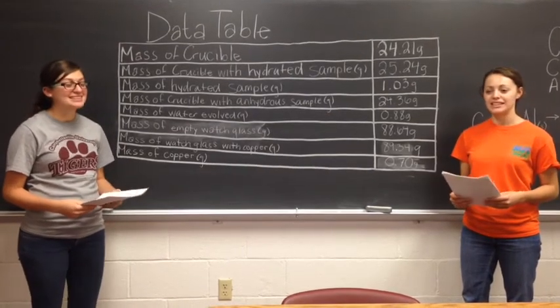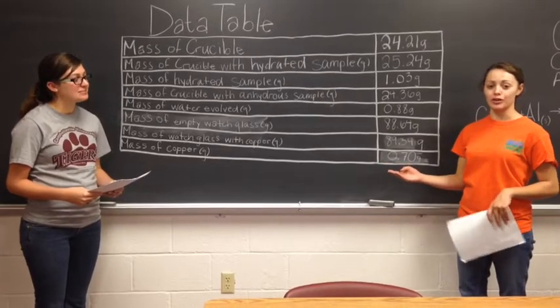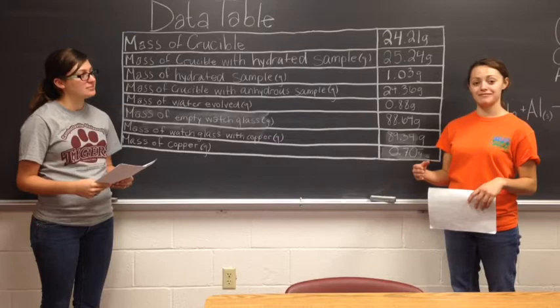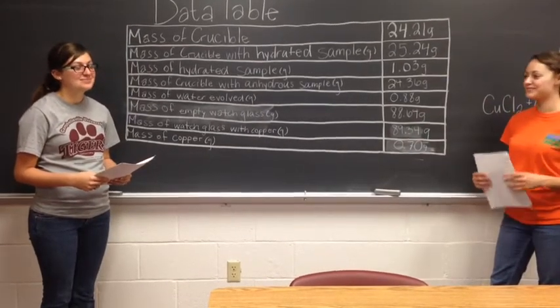And I'm Nikki. And today we're doing a short video titled The Determination of a Chemical Formula for a Copper Chloride Solution, an experiment that we did in class.